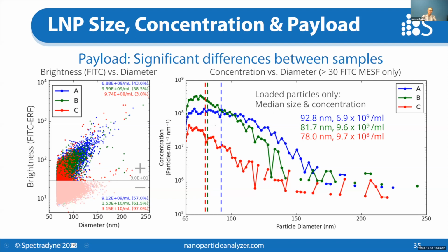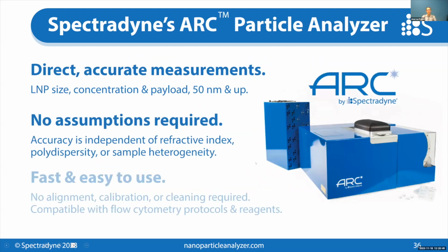So these inform the formulation process and are important for why you want to use the ARC to measure your LNP formulations.